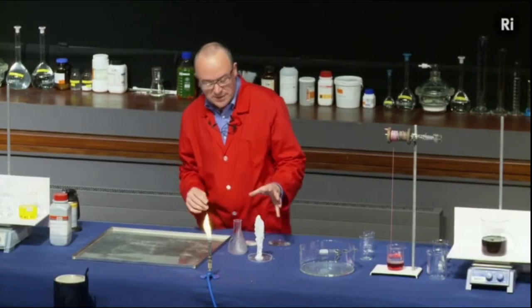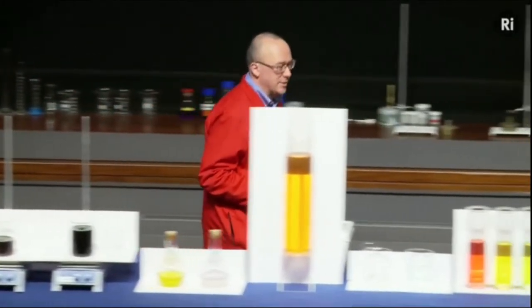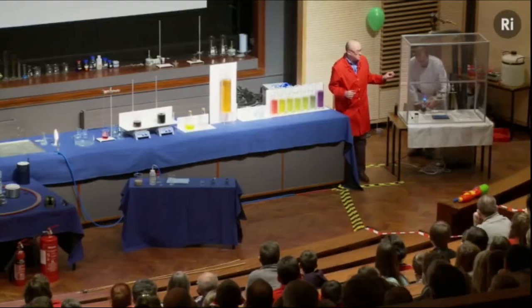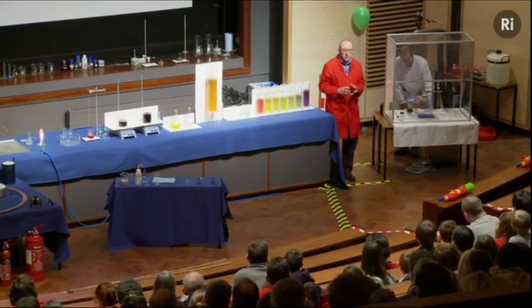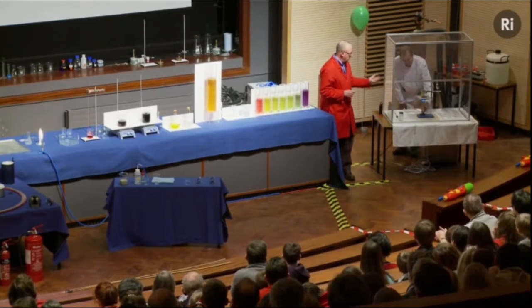Okay, so that's sodium acetate, a sort of chemical sculpture. I'm going to show you now another way to make a chemical sculpture. And Chris has been preparing this. This beaker contains a mixture of para-nitroacetanilide and sulfuric acid. And Chris has been warming it up.